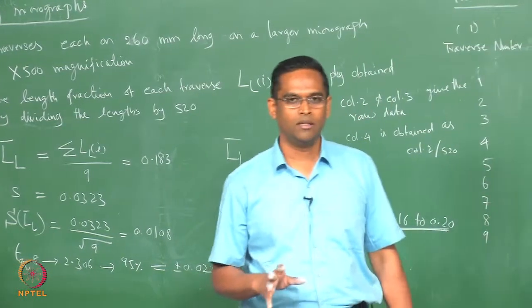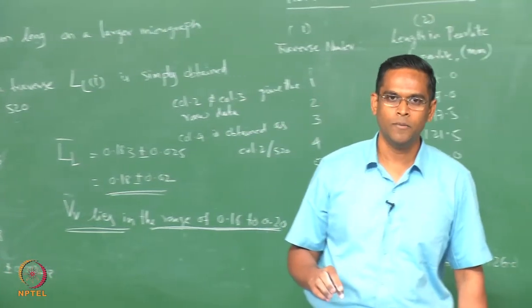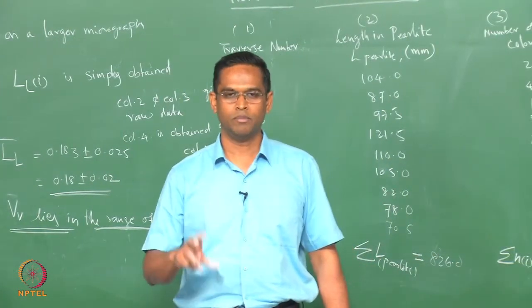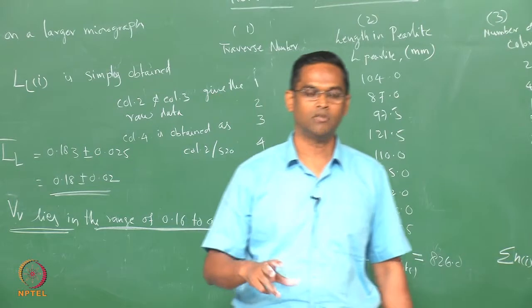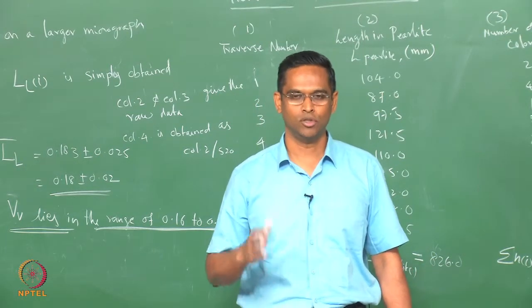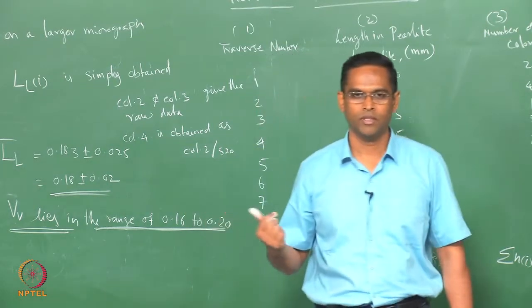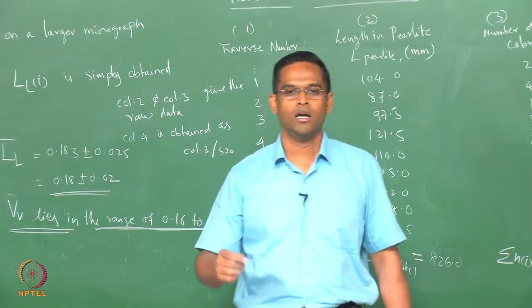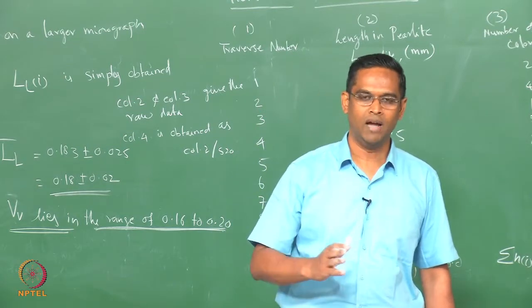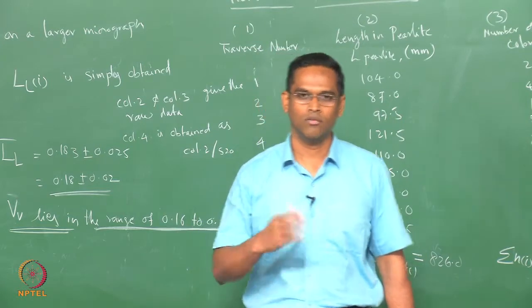But the point I am trying to make is that the analysis is very elementary, but the data presentation is very important. That is why we introduced some statistical methods which you should know, and how to present the result. You should not just give one value, you should have the error bar, standard deviation, confidence level and so on.